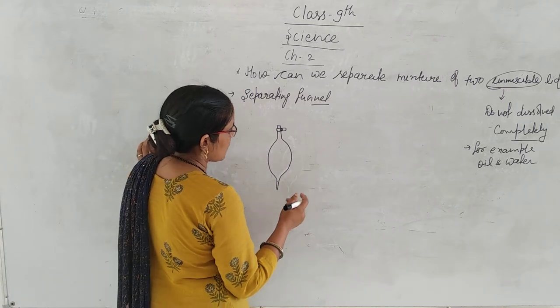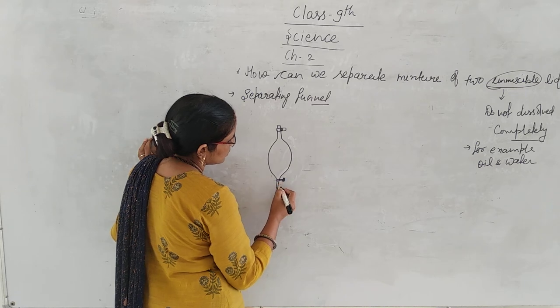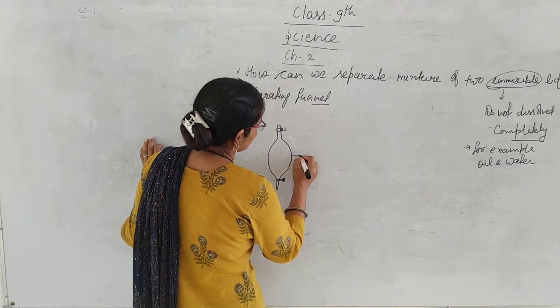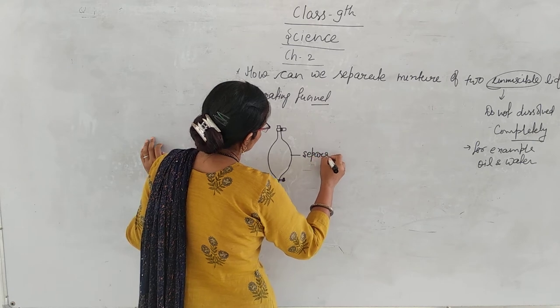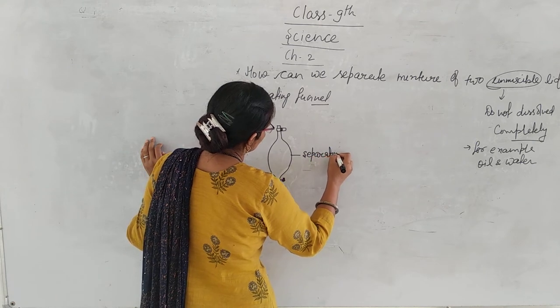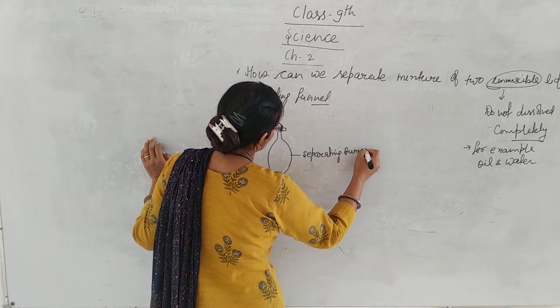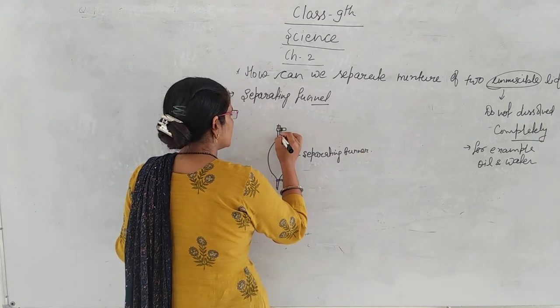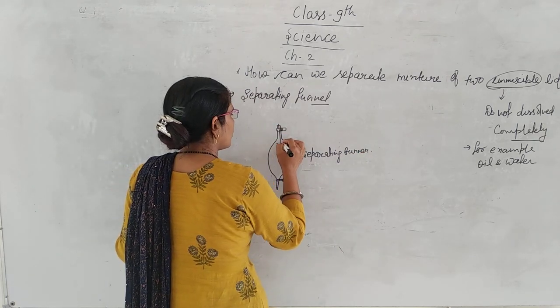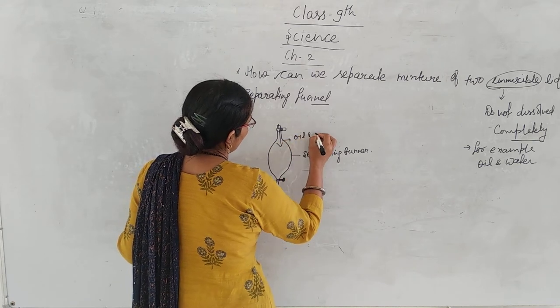So this is a separating funnel. How can we separate using it? There is also a knob on it. We add the mixture of oil and water into the separating funnel.